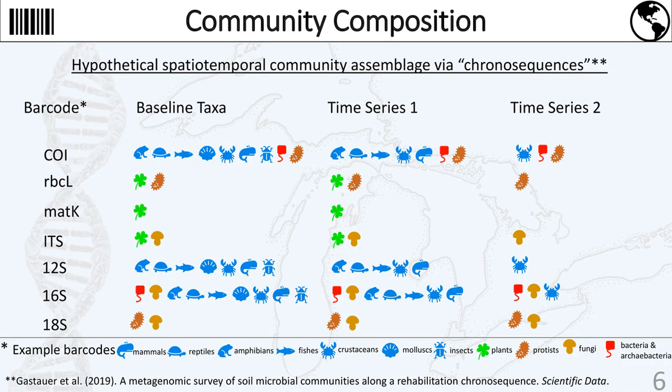In the previous example, we communicated how metabarcoding can establish a baseline of community composition and species richness, even in systems in which we had no prior or no confirmed evidence of species presence. These baselines established in remote systems represent an optimal case, often conducted prior to the establishment of local primary resource activities, for example, forestry or mining. By employing multiple markers, entire biotic communities, from bacteria to metazoans, can be simultaneously described and the relative changes in their abundance over time and space be documented.